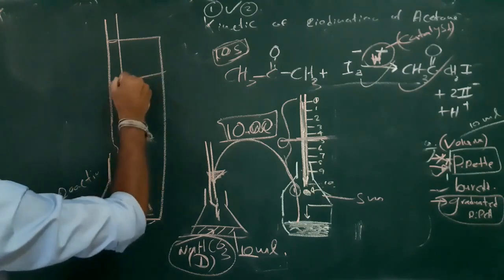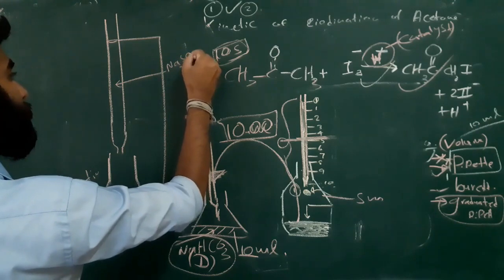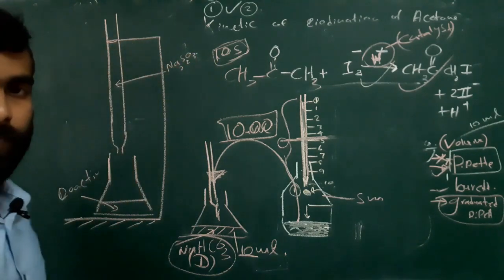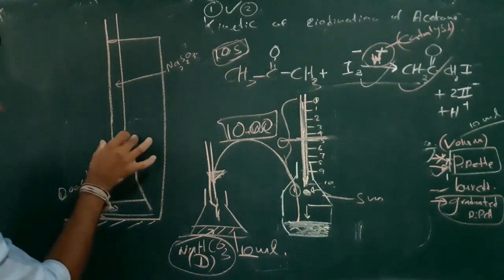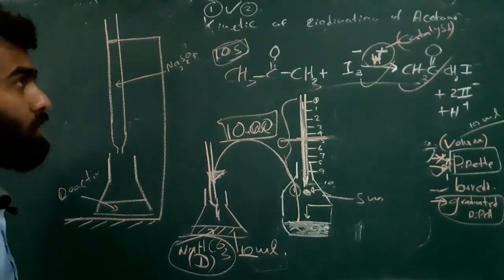We use sodium thiosulfate solution. Okay, we will start the titration. What will happen? This sodium thiosulfate will react with the remaining iodine in the solution.